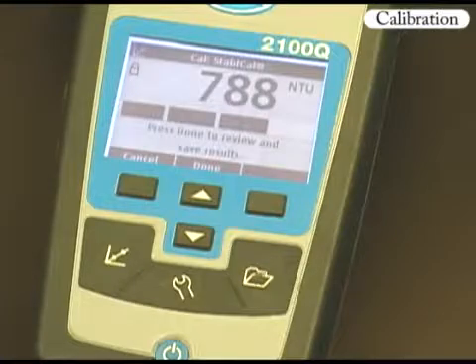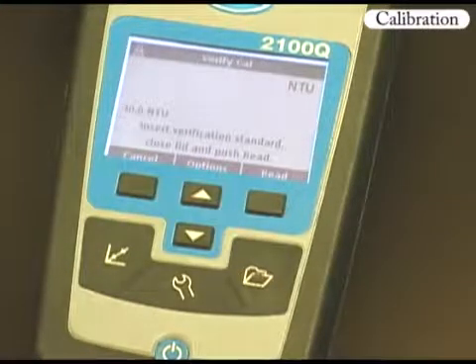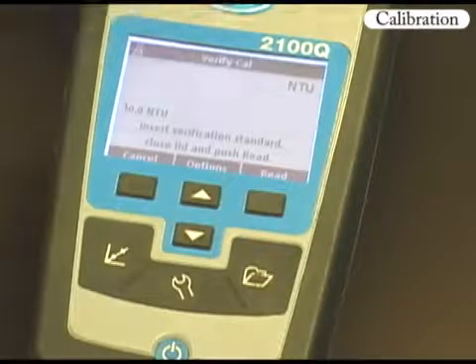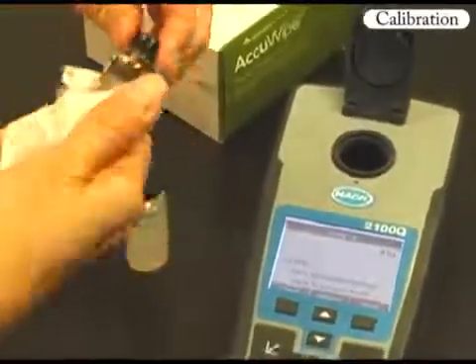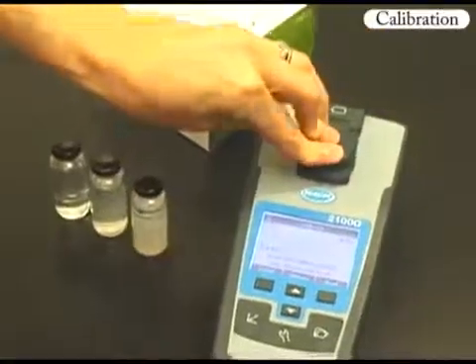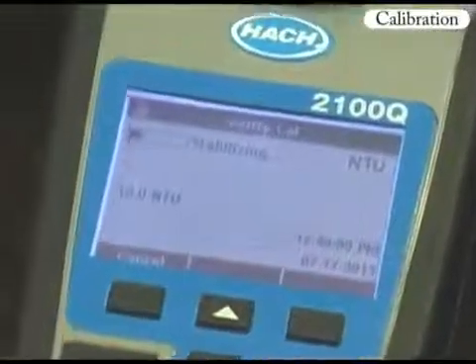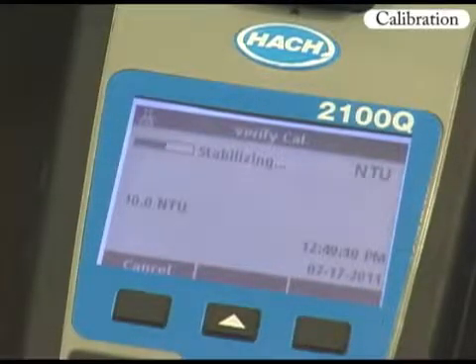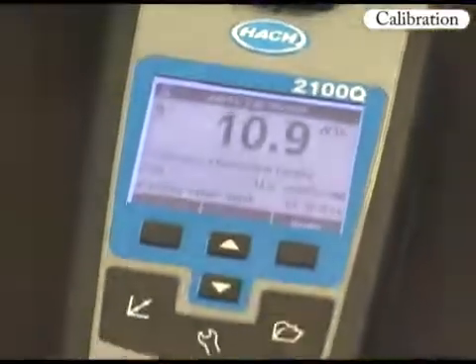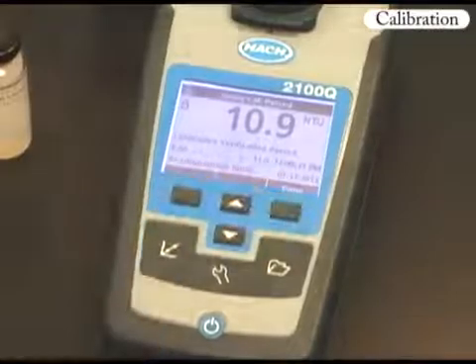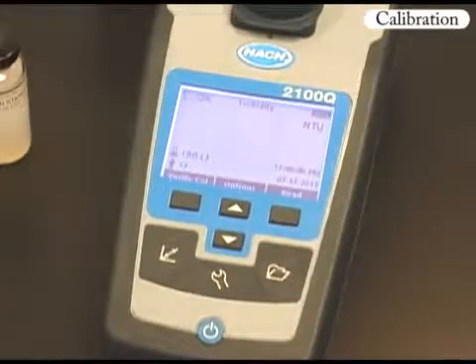After completing the calibration, press Done to review calibration details and Store to save the results. After the calibration is stored, the instrument automatically goes into verification mode using the 10 NTU StableCal Verification Standard. Acceptance criteria can be set to determine passing or failing based on the user's requirements; the factory default is plus or minus 10%. Repeat the calibration verification if the verification fails. If the verification fails repeatedly, recalibrate the instrument. Most regulatory authorities recommend weekly verification. Note the Calibration OK icon indicating that the calibration verification was successful.